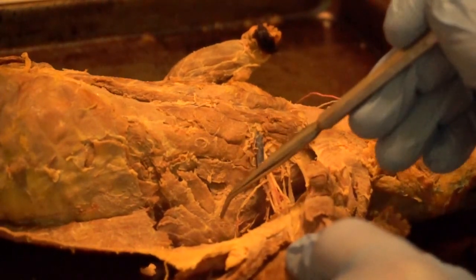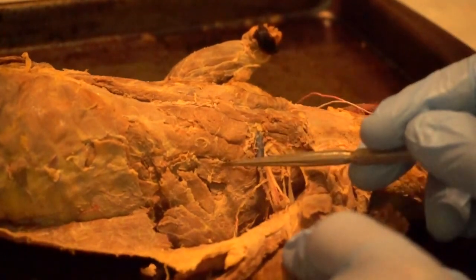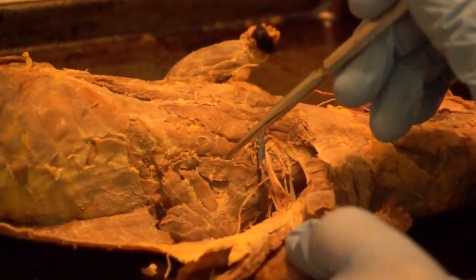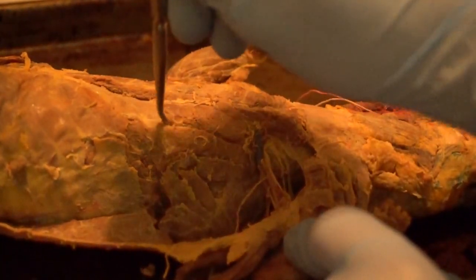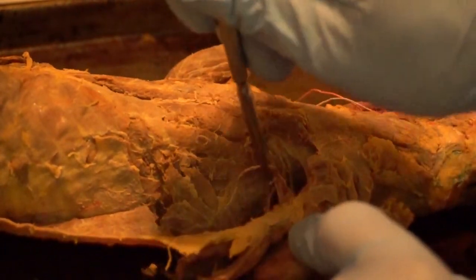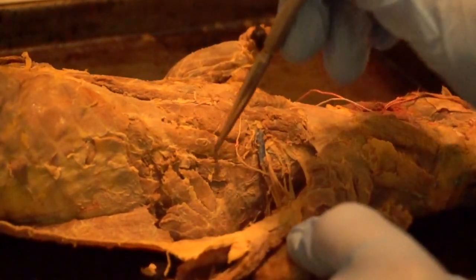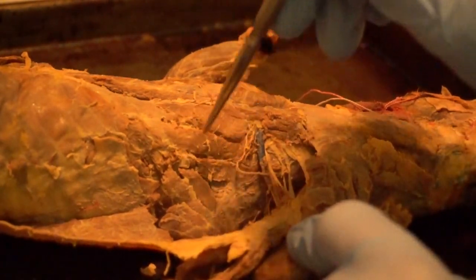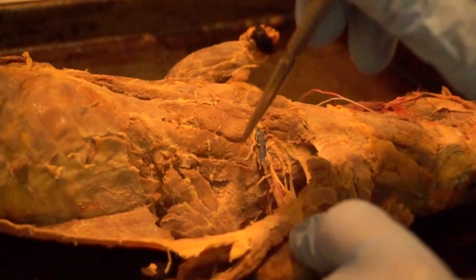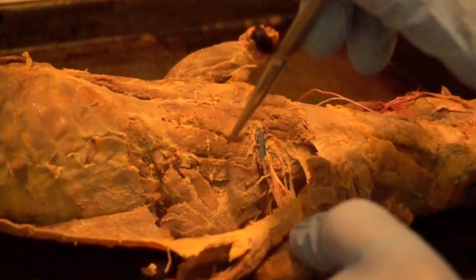You can see the serratus ventralis from two different angles — from this angle or from the backside. Right above the serratus ventralis you're going to see another muscle with multiple heads. You don't need to know every head, just one. This is your scalene muscle — specifically this very long head is called your intermediate head. We do have a medial and lateral head that you don't need to know. Just know if you see this, it's the scalene muscle, specifically the intermediate head of the scalene muscle.